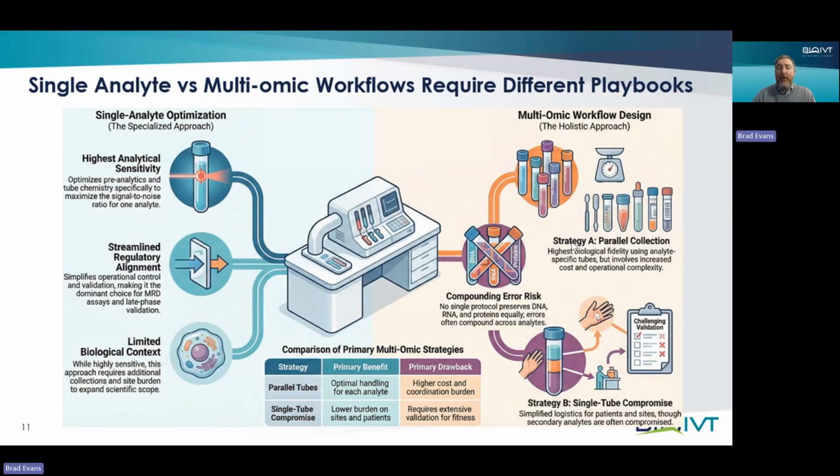Up to this point, we've been talking about how pre-analytical variables shape the biology of the sample. This slide shifts from mechanisms to strategy. It highlights a core reality in liquid biopsy. Single analyte and multi-omic workflows are fundamentally different design problems. On the left is a single analyte optimization approach.